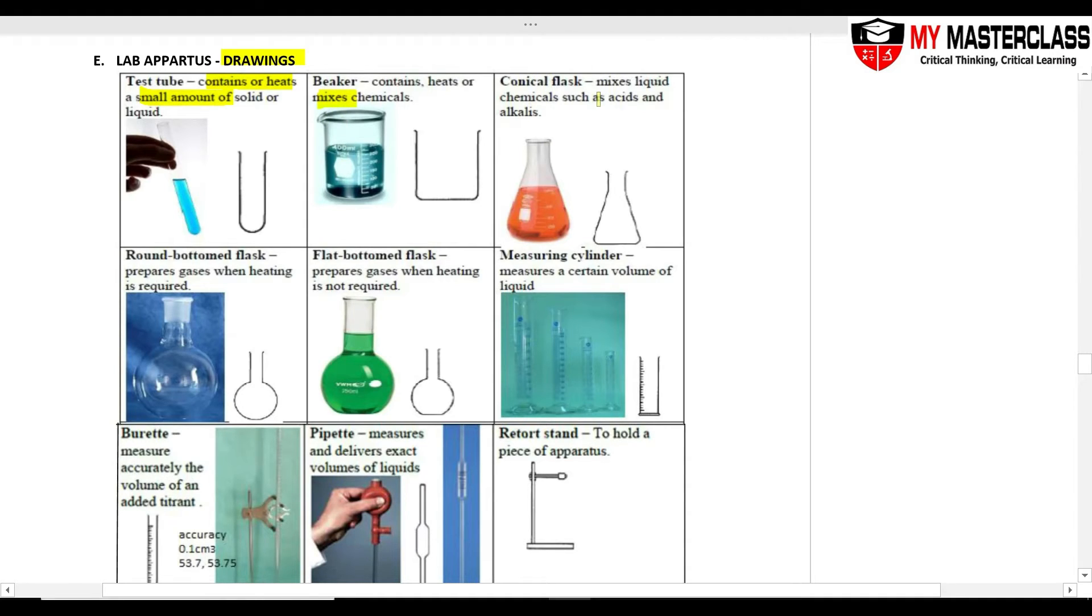Conical flask, this one is to mix liquids such as acids and alkali. The big difference between your beaker and your conical flask is that this conical flask, the mouth is very small. So when I say the mouth is very small, meaning to say the opening is very small so that the chemicals don't spill out very easily. So it's more safe. It's safer to heat your acid or to mix your acids and alkali.